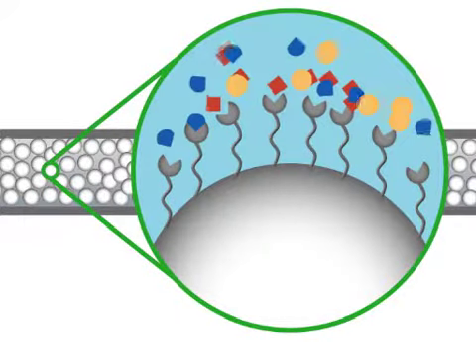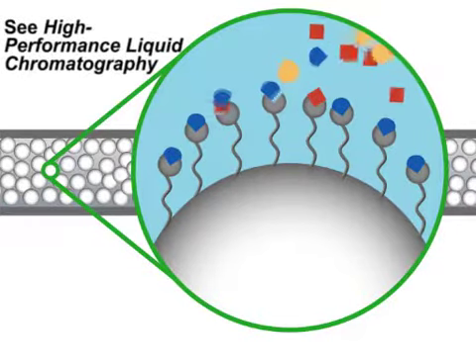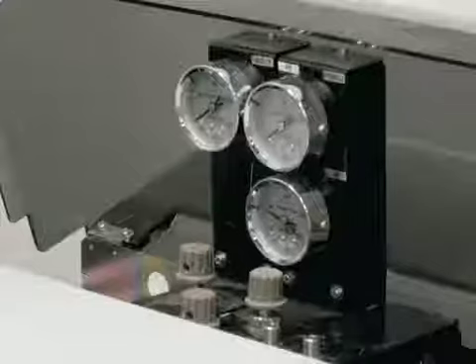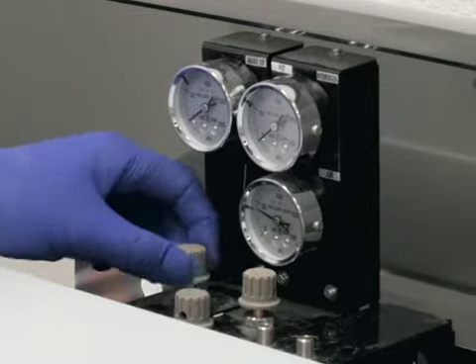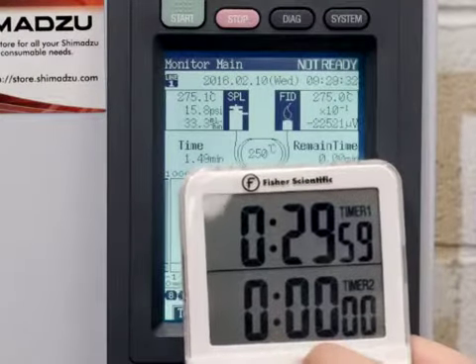For larger, aqueous, or polar molecules that are difficult to vaporize, liquid chromatography is a useful alternative. This video will introduce the basics of gas chromatography and illustrate the steps required to analyze the chemical species in a non-aqueous mixture using a sample gas chromatograph.